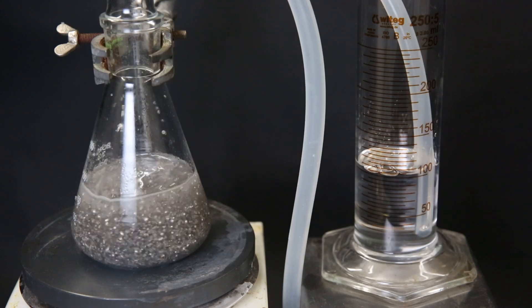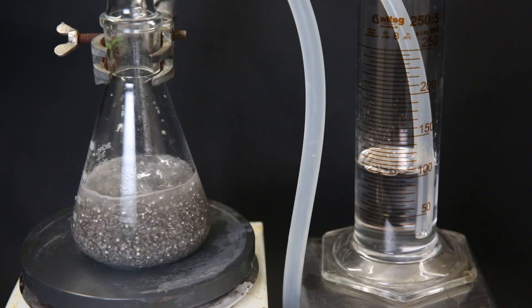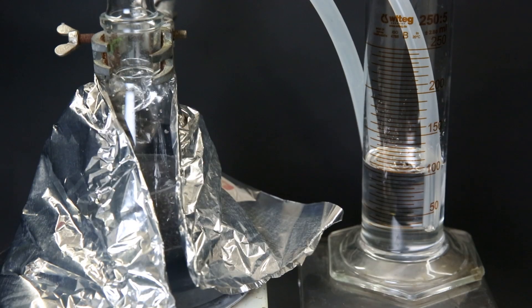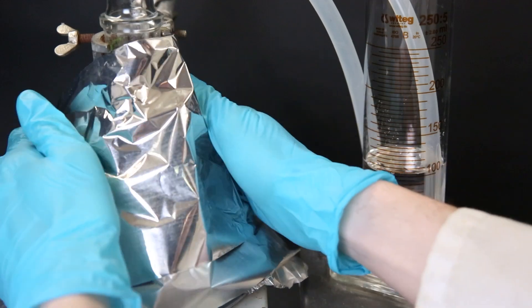To get the flask to 200°C I need to insulate it well since the contact surface is relatively small. So I put up multiple layers of aluminum foil to trap the heat and then I leave it to react overnight.